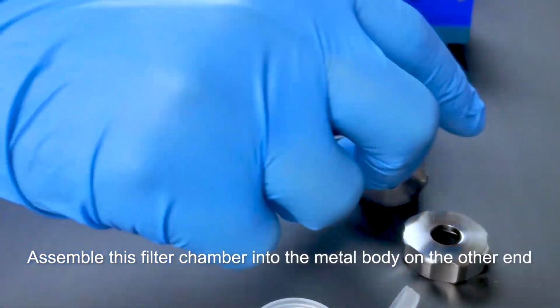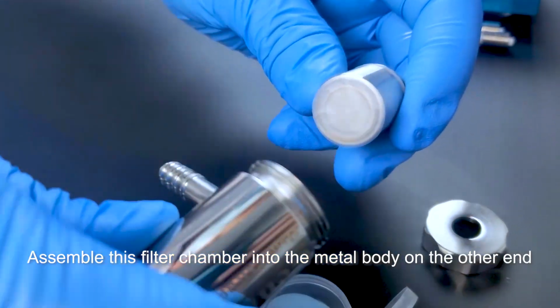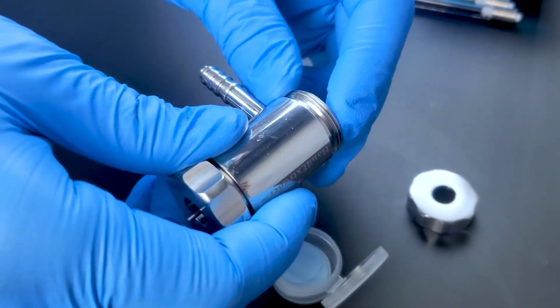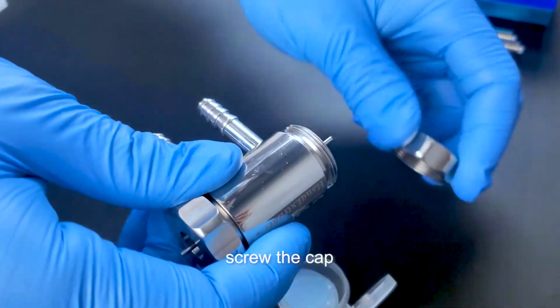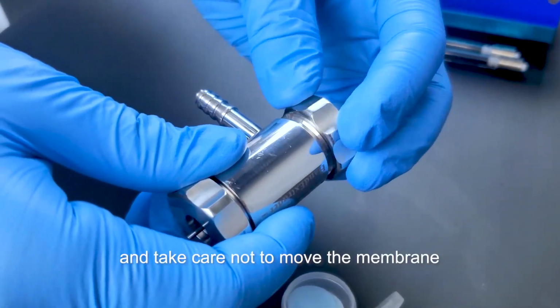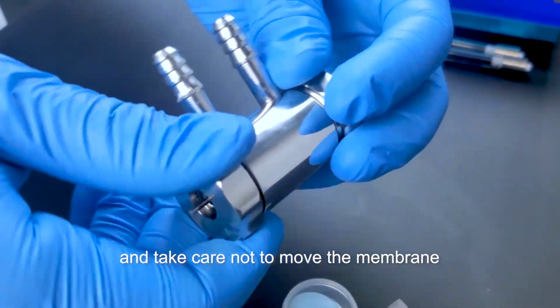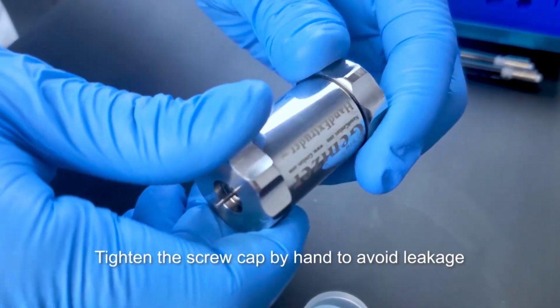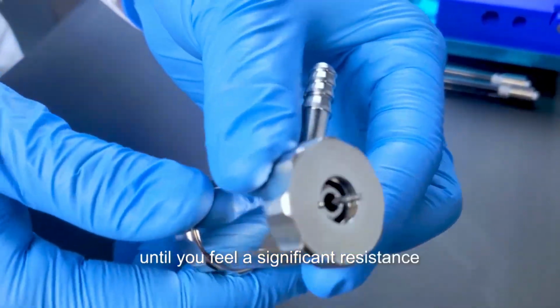Assemble this filter chamber into the metal body on the other end. Screw the cap. And take care not to move the membrane. Tighten the screw cap by hand to avoid leakage, until you feel a significant resistance.